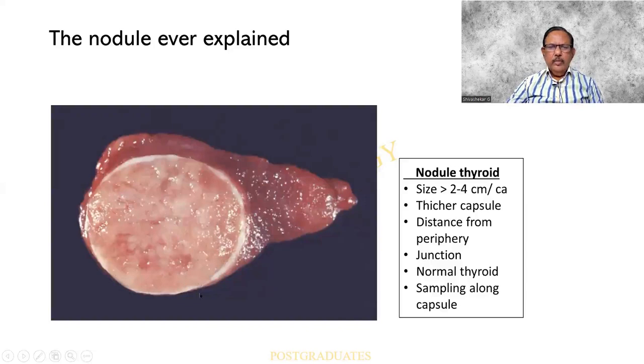Look at this one. It is almost similar to what is being shown. It is a nodule that has never been explained. Now, how do you distinguish between a solitary nodule and a nodule in a case of a multinodular goiter which is dominant? So there are certain things which people can read up. There will be a uniformity within the nodule, and then there will be a dissimilarity within and without the nodule. Outside, there will be the compression of the normal thyroid tissue, and it is totally circumscribed by means of a capsule. These things you people should be having at your fingertips.